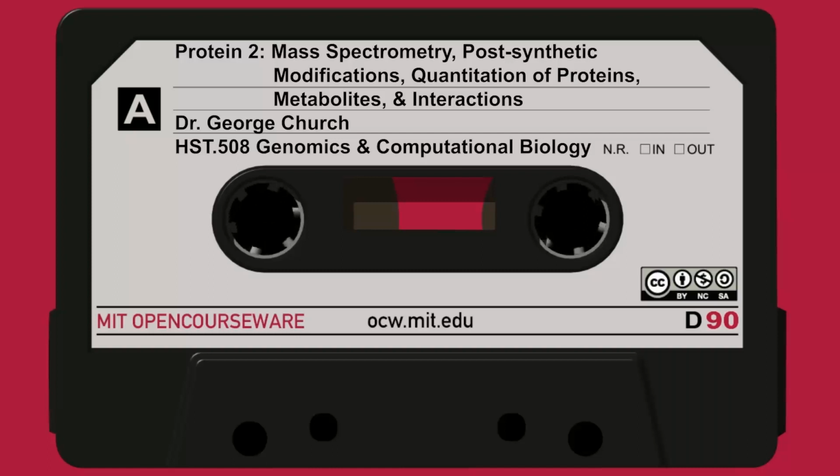Not only the mass, but the liquid chromatography properties of either protein or peptide can be calculated. Here you take amino acid composition and you do linear regression on a calibration set, and you can get the precision on the order of 5% or better.